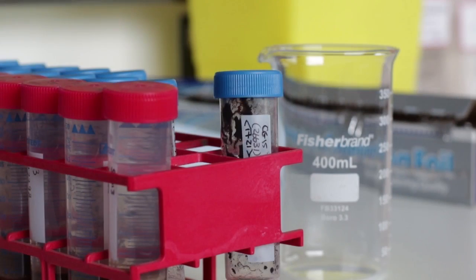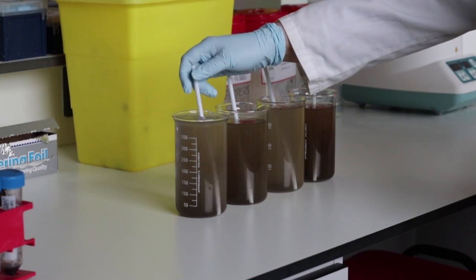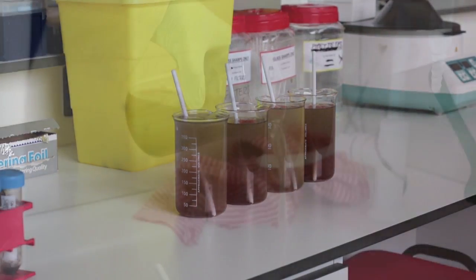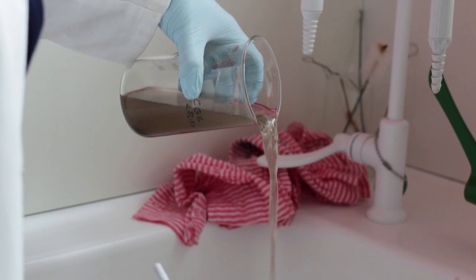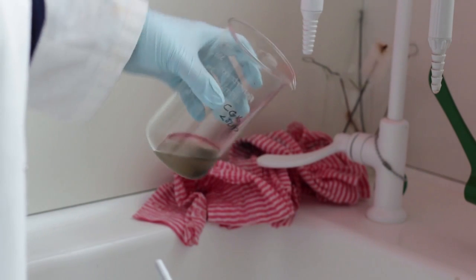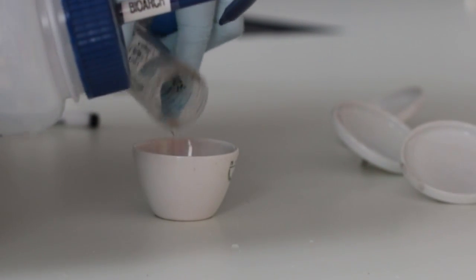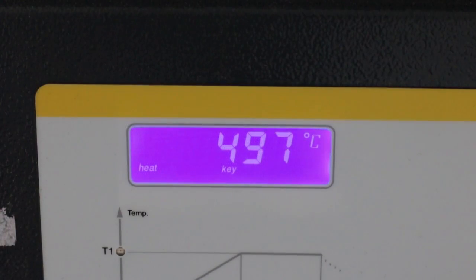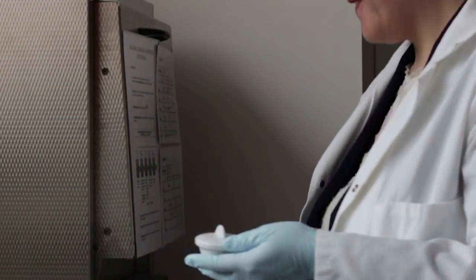I would first of all remove the clays from the sample by deflocculation. Essentially, you place the soil in a beaker and stir it so that all the clays float in the solution, and then you pour off the clays in the solution after all the silica and silt has sunk to the bottom. And following that, you would remove the carbonates from the sample by adding hydrochloric acid. You would then undertake organic removal by placing the samples in a muffle furnace, which burns off all the organics and leaves you with your silica microfossils.